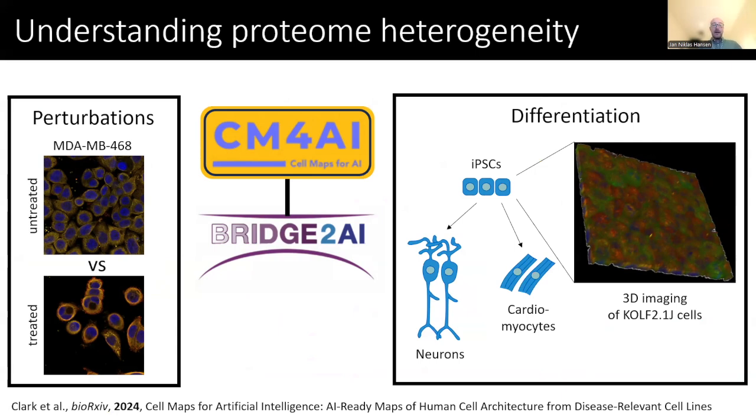So our contribution to the CM4AI project is to generate data and tools that allow us to visualize with subcellular spatial proteomics where proteins localize in cells, for example, in these untreated or anti-cancer treated breast cancer cell lines, or how they basically relocalize and change in differentiation processes.